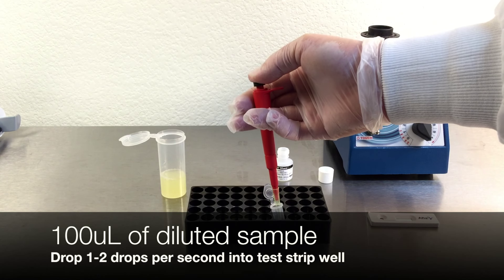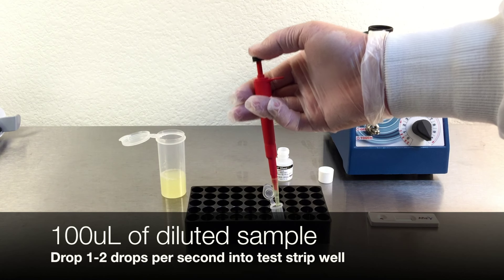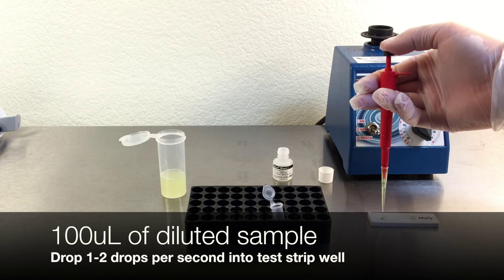Pipette 100 microliters of the diluted sample, 1 to 2 drops per second, into the test strip well.